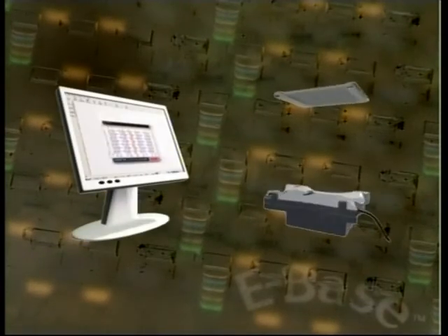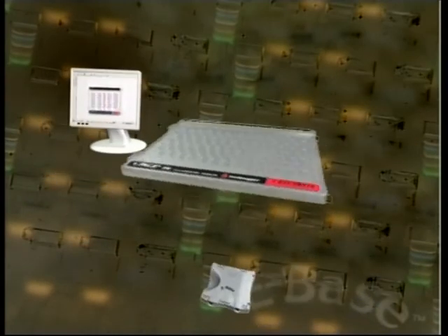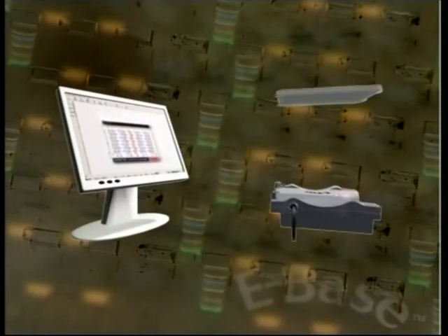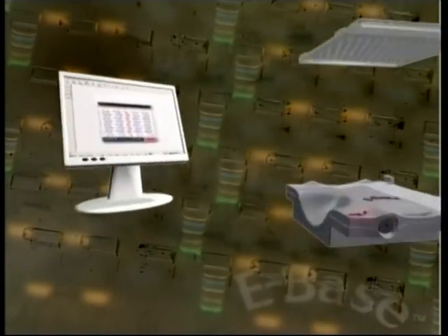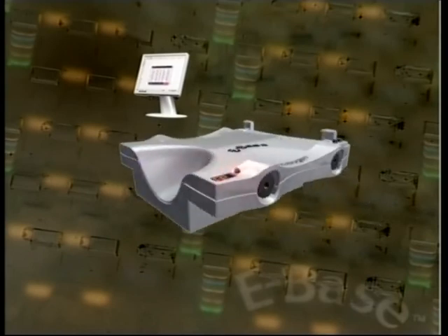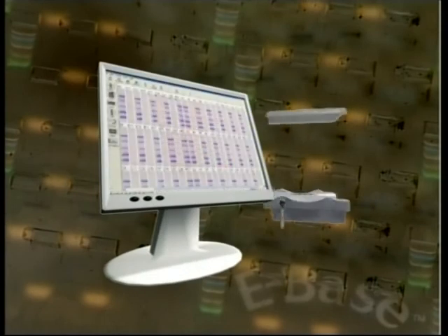The ePage system consists of three individual components: the ePage gel cassette, the eBase integrated power supply, and the eEditor image editing software.